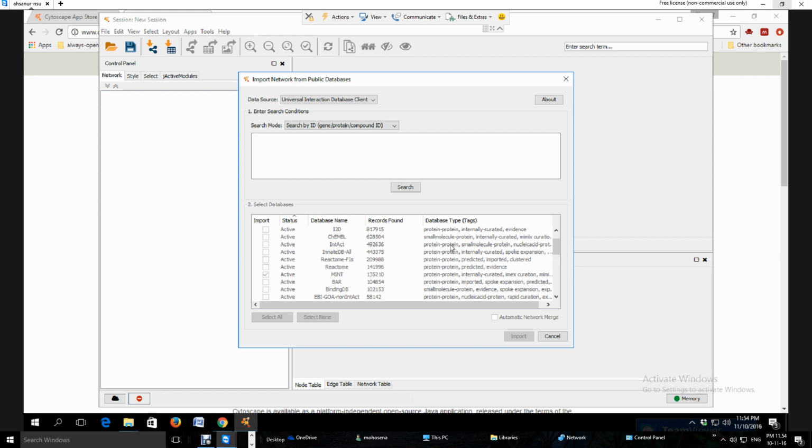It can be a drug molecule as well. And nucleic acid, you know about nucleic acid, the RNA and DNA. Proteins can bind with these kinds of nucleic acids and thereby perform some task. So Intact contains protein-protein interaction as well as small molecule protein interaction as well as nucleic acid protein interaction.